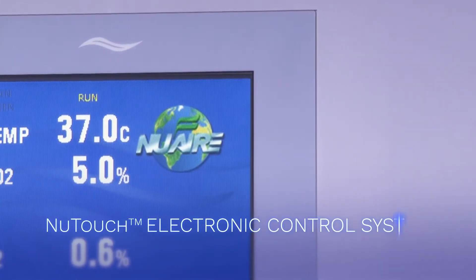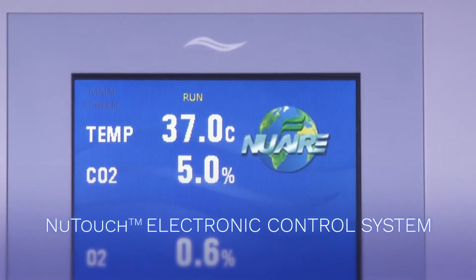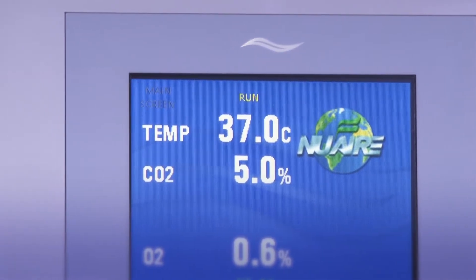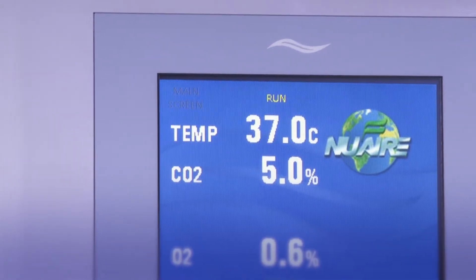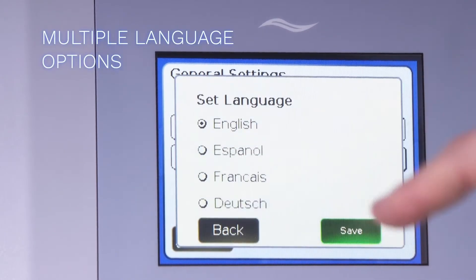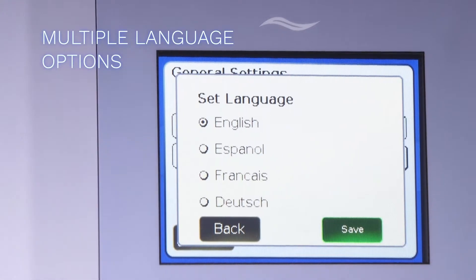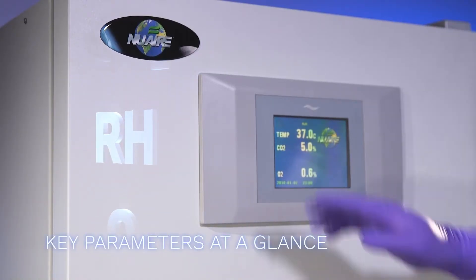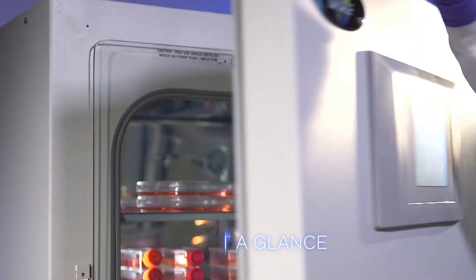Because accuracy is vital, the new touch electronic control system is designed to easily and precisely control the parameters needed for optimal cell culture growth. Information on the user-friendly 5 by 7 inch color touch screen is available in English, Spanish, German, and French. At a glance, you can monitor temperature and CO2.